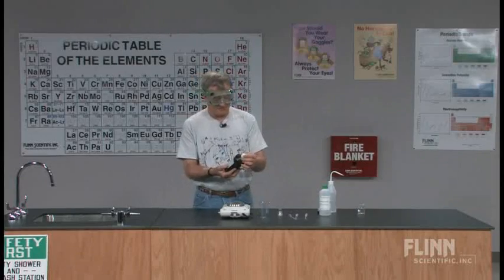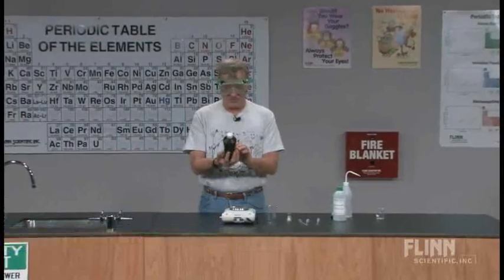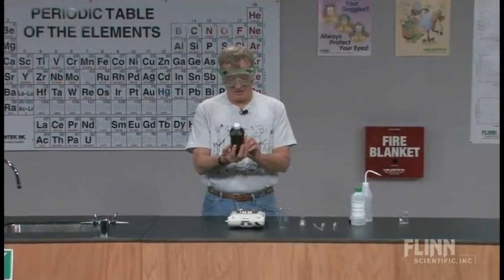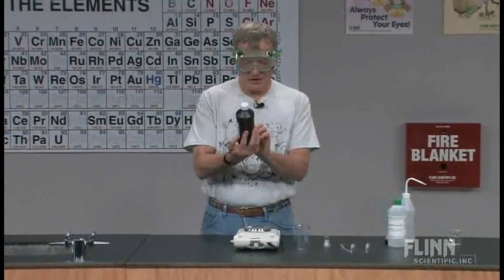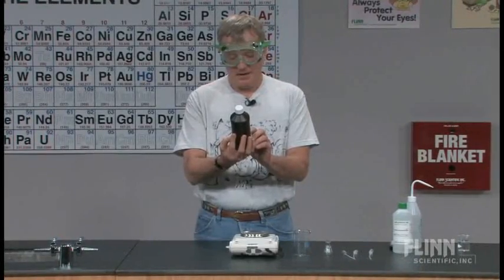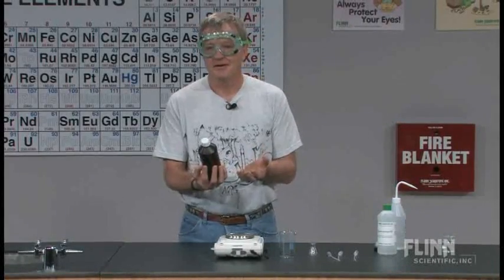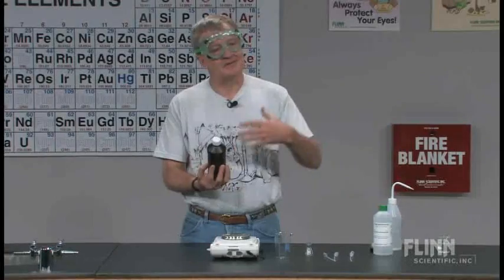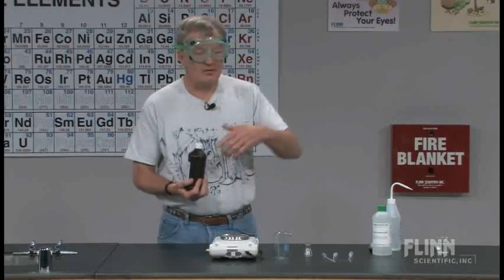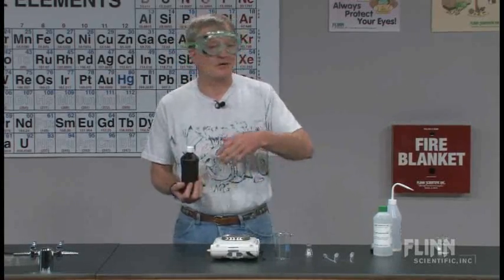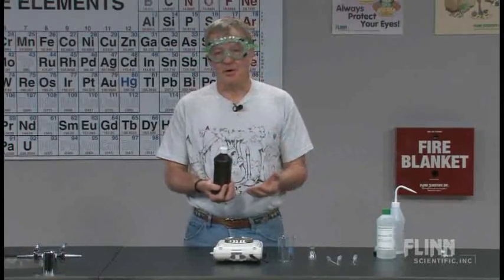This is household hydrogen peroxide. If you look at the label and work your way down, it tells you it's used as an antiseptic. At some point on the side it says this is 3% hydrogen peroxide solution. I've had students ask me how do I know that's 3%, is there some way you can test it? We ought to be able to do a lab to test hydrogen peroxide or other household products and actually prove they're 5% vinegar or whatever it might be. Hydrogen peroxide is fairly simple to test for, so we've designed a lab for that.